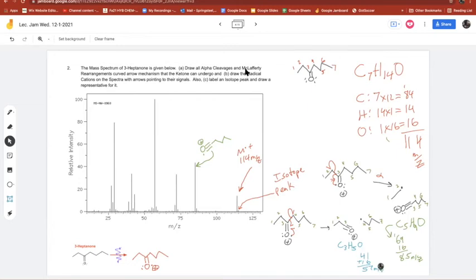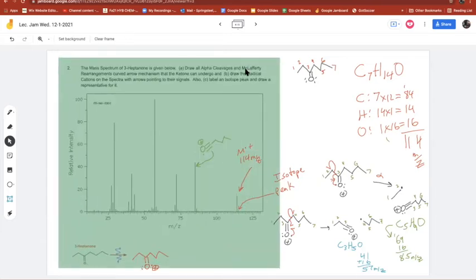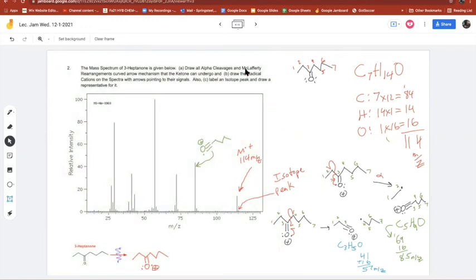Yeah, the Heinz 57 fragment here. Let me double check my math. 3 times 12 is 36, and 5 is 41, plus 16, 57. Yep. All right, so where's that one showing up? Ooh, is that the base peak? Oh no, accidentally did something. Let me rewind that. Does that look better? Yeah. Okay, there we go. Do I see that one in here?